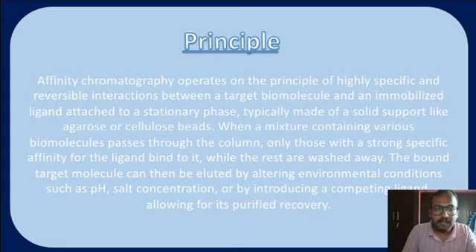The principle on which affinity chromatography works is that the ligands are immobilized on a solid matrix such as agarose or cellulose beads, to which the mixture, or the mobile phase that contains the sample, is poured. In the mobile phase, the target molecules have specific affinity towards these ligands and get bound. The rest of the unwanted molecules are washed away, and later on, using a special elution buffer, or by altering the environmental conditions such as pH, concentration of salt, or by introducing a competing ligand, we can separate the target molecule.